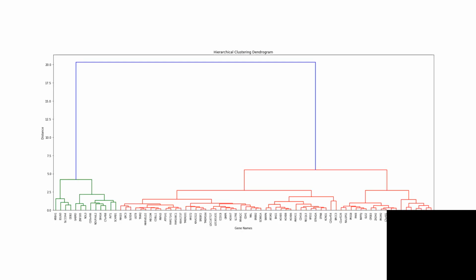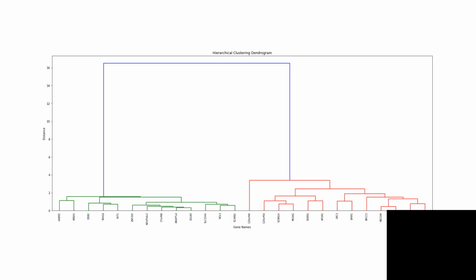So you see those clusters here, or I'm sorry, the dendrograms here. And what I focused on, and we'll take a look at this other dendrogram as well, I focused exclusively on the green cluster. My goal at the outset was simply to identify one interesting gene that I could conduct some brief research on, formulate a hypothesis, test the hypothesis, and briefly discuss and elucidate for everyone's edification.